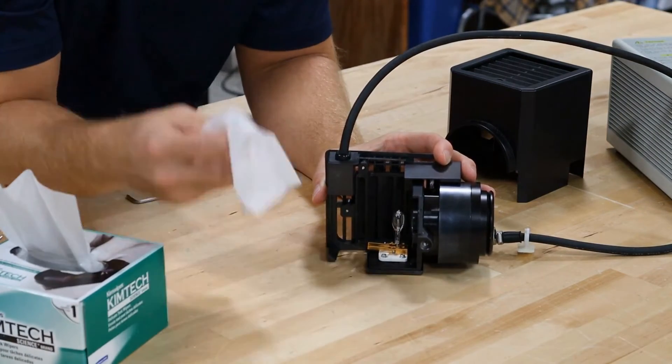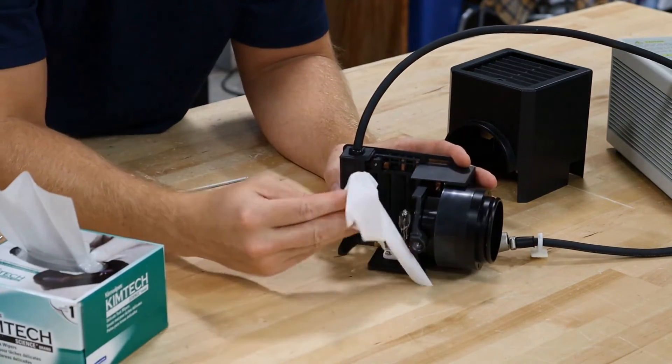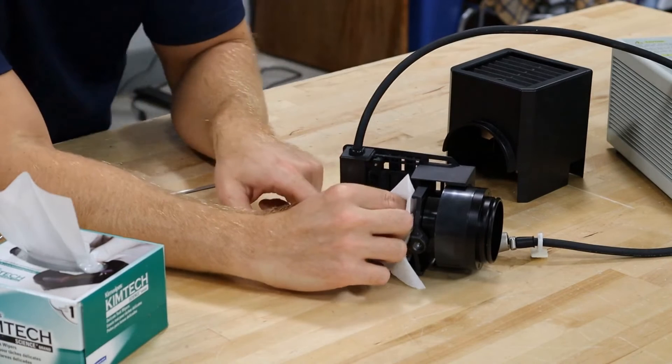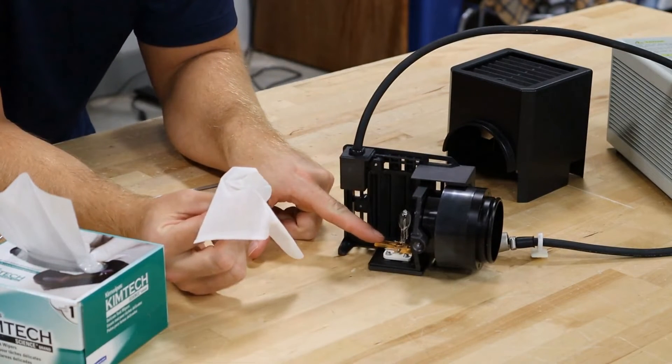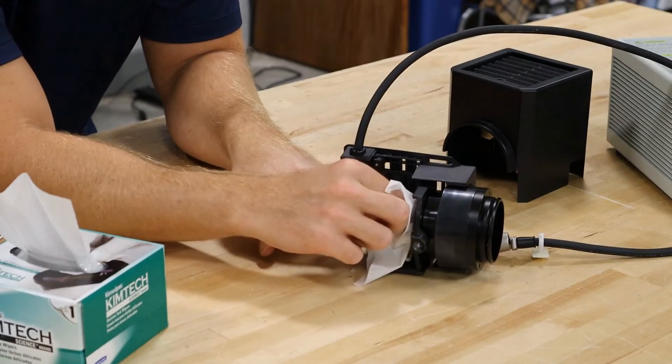Here you're going to see Chad point out the two little spring levers you need to push down in order to remove the bulb. Just push those down with a little bit of pressure, then grab the bulb with your chem wipe and pull straight up and the bulb will come out.